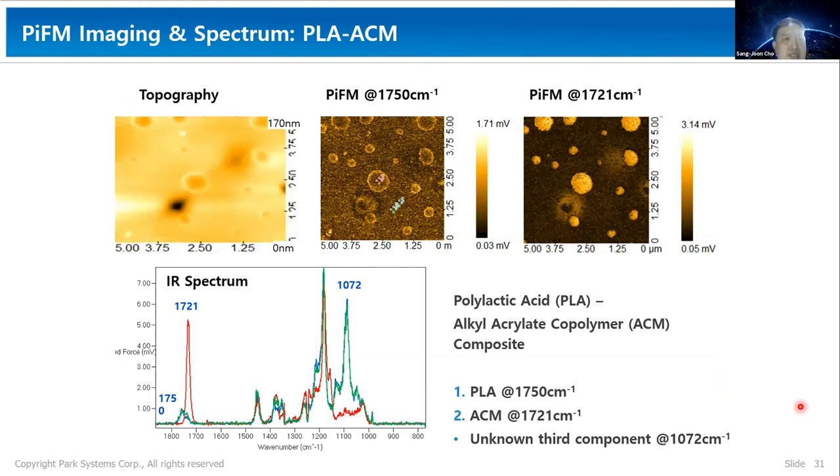With global attention on the role that plastics play in our ecosystem, many researchers are investigating new bioplastics or biodegradable polymer alternatives to reduce the ecological impact of plastic packaging. One such promising thermoplastic is a polylactic acid called PLA. This bioplastic decomposes into lactic acid and can be derived from renewable resources like cornstarch or sugarcane during starch fermentation. So PLA is widely applicable, cost efficient to produce, and degrades naturally in the environment under certain conditions.